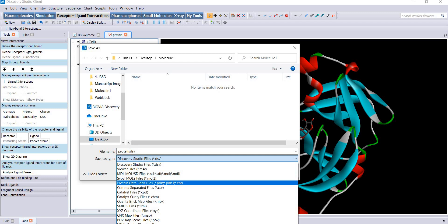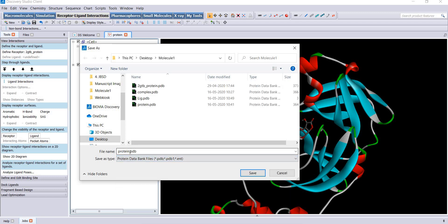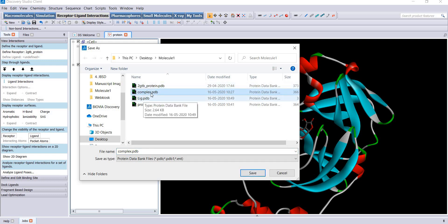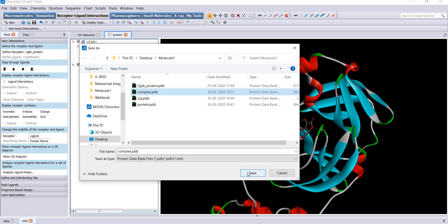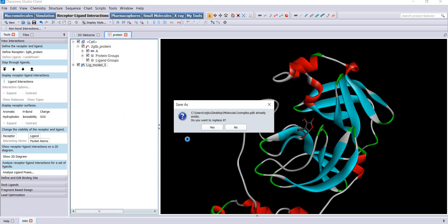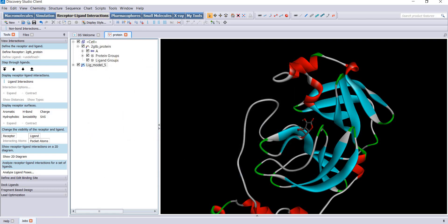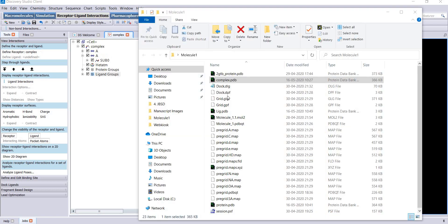Here is your file complex.pdb. It can be used for LigPlot analysis later.